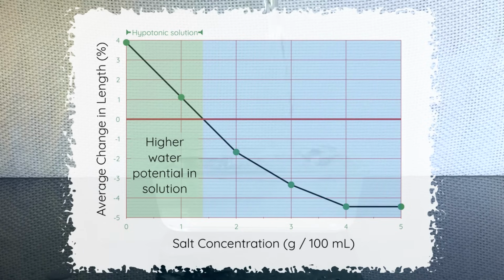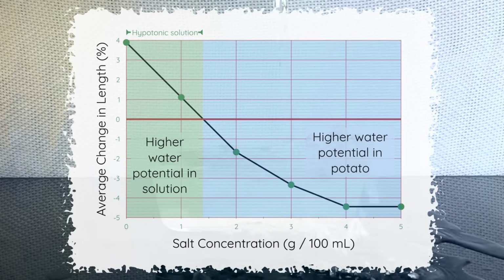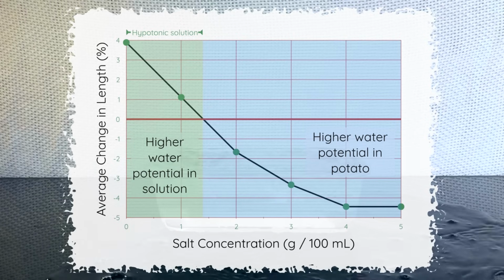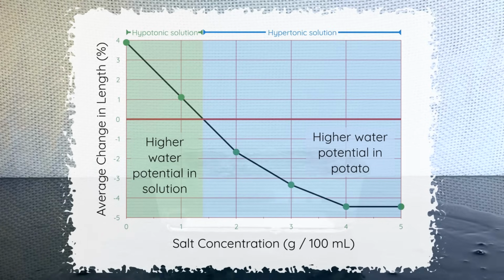At higher salt concentrations, however, we have a decrease in potato strip length. This tells us the water potential is higher inside of the potatoes, so water has left the potato strips by osmosis. We can say that the solutions are hypertonic to the potatoes. At the point the graph crosses 0, which is about 1.4 grams per 100 milliliters of salt, the solution is isotonic, meaning the water potential inside the potato is equal to the solution. So at that point there is no net movement of water.